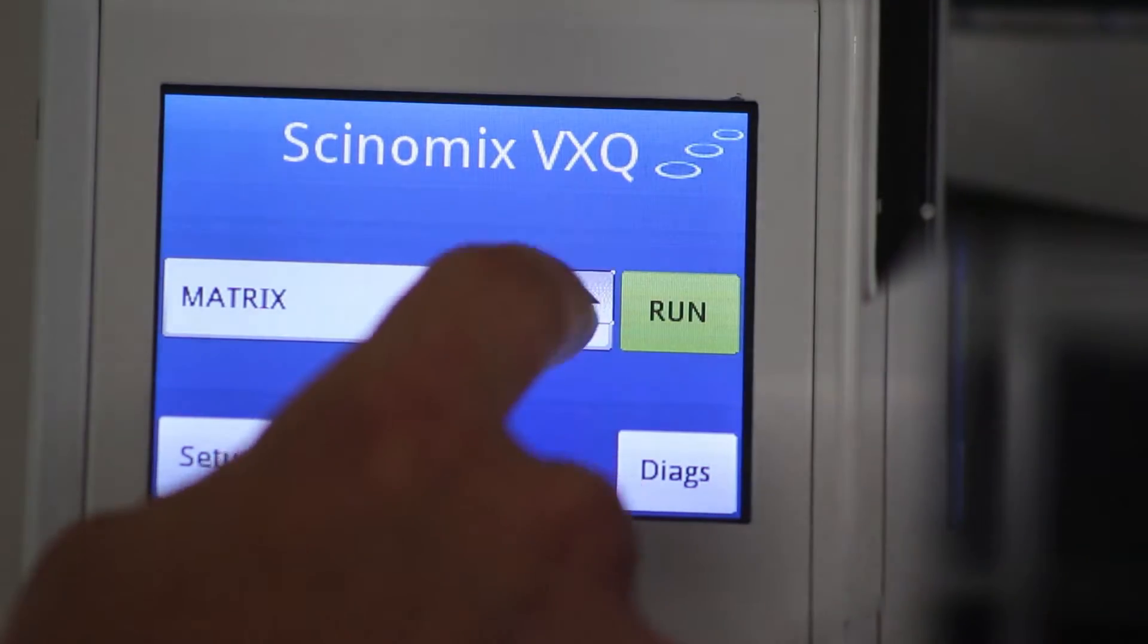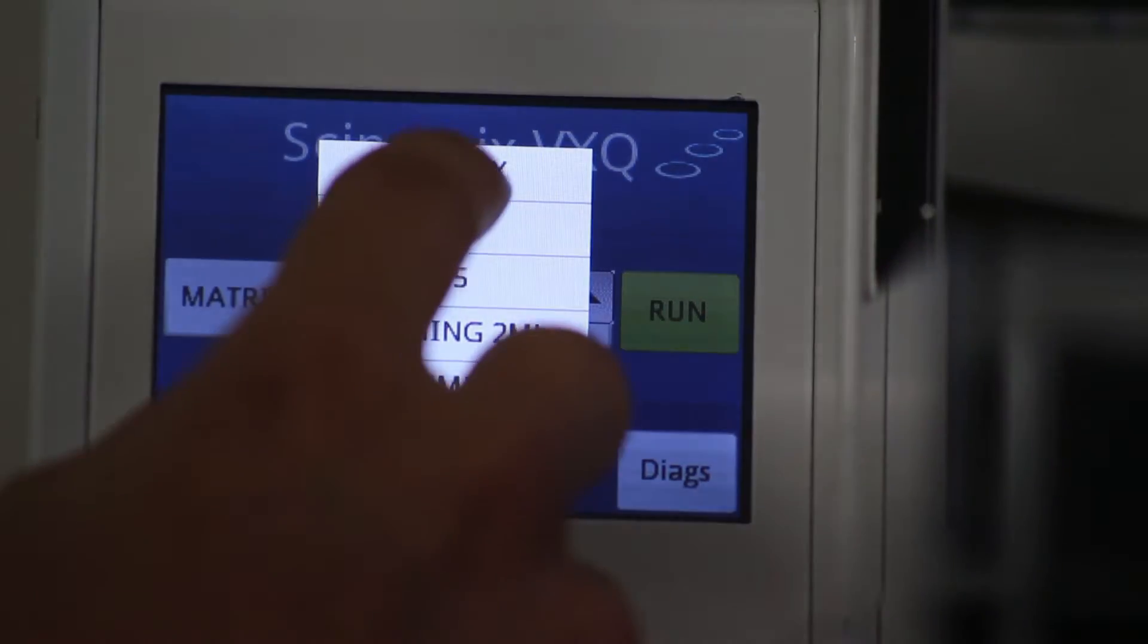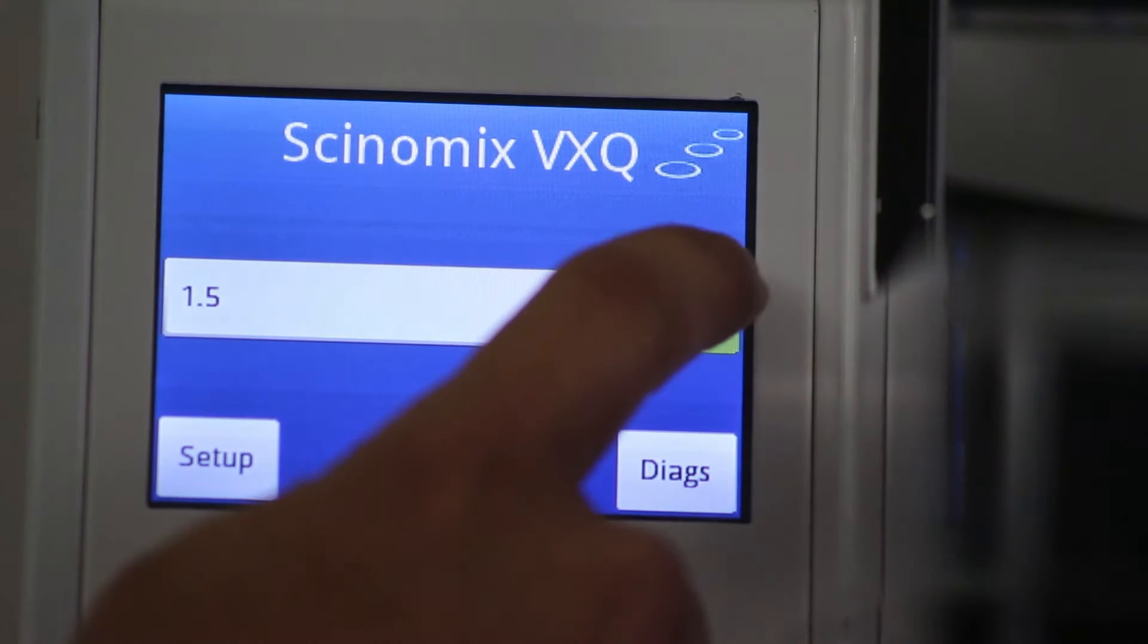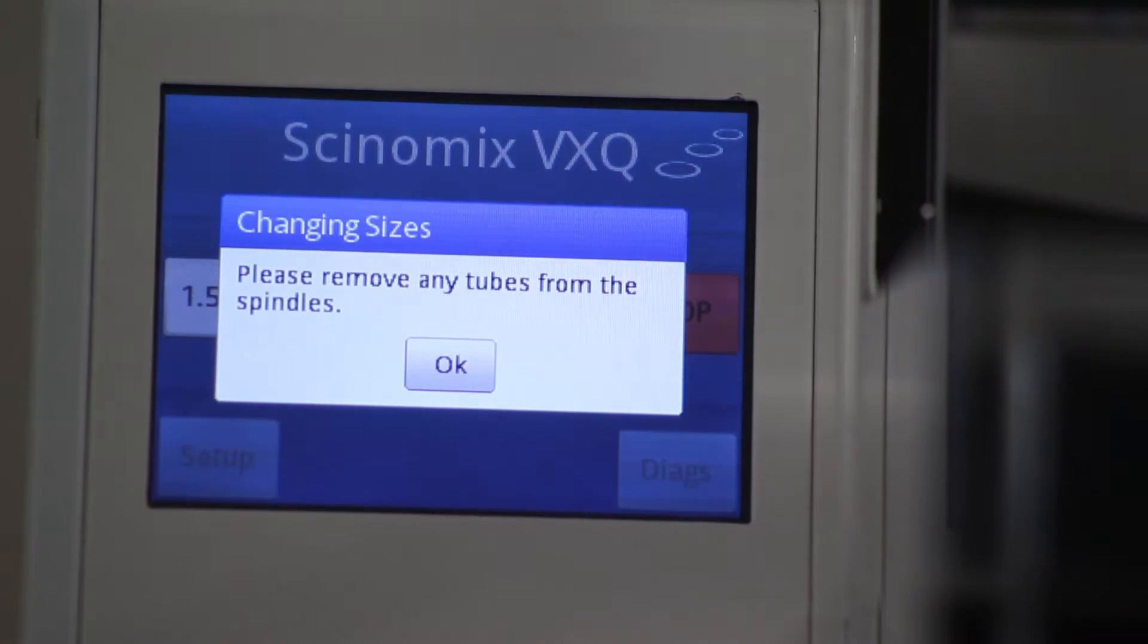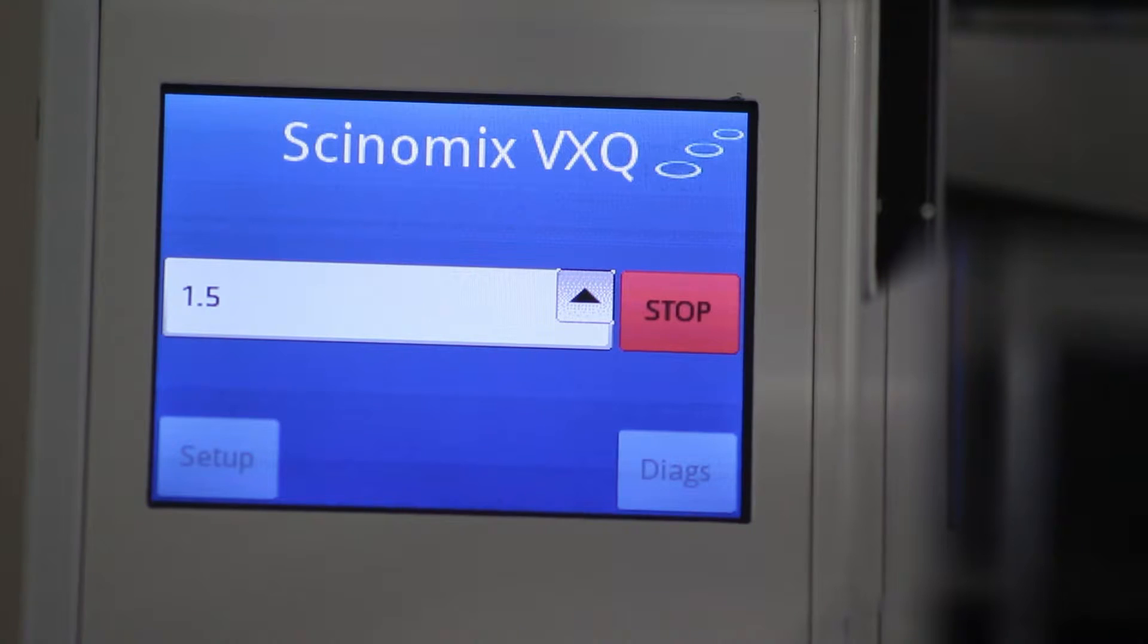The touch screen located on the front of the system allows the user to easily configure settings. These settings can then be saved to the system and recalled for later use. This flexible design allows the user to easily change between tube types with the touch of a button.